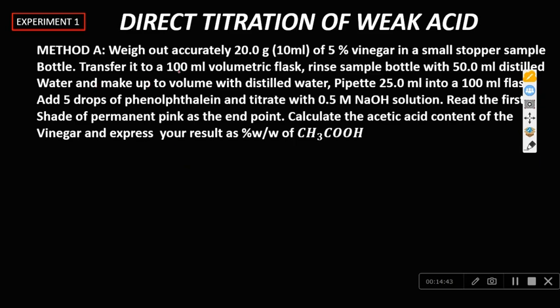Now the question says weigh out accurately 20.0 gram, 10 ml of 5% vinegar, in a small stoppered sample bottle. Transfer it to a 100 ml volumetric flask. Rinse the sample bottle with 50 ml distilled water and make up to volume with distilled water.